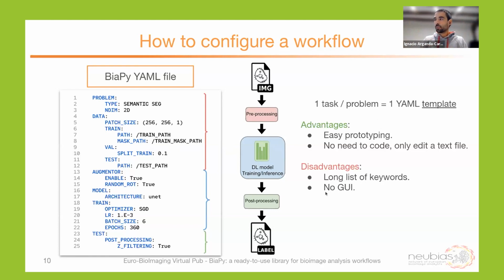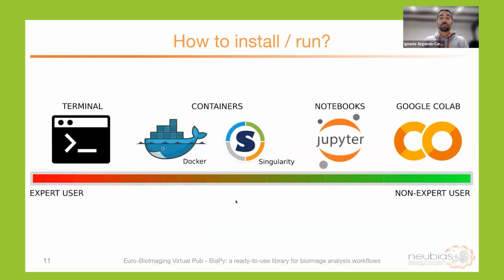So at this point, we didn't have a GUI. So editing this was, well, for me, useful, but I understand for non-experienced users could be very tough. So how do we install and run BiaPy?